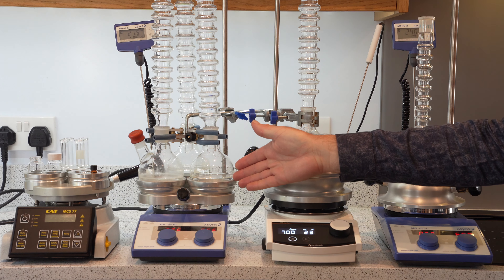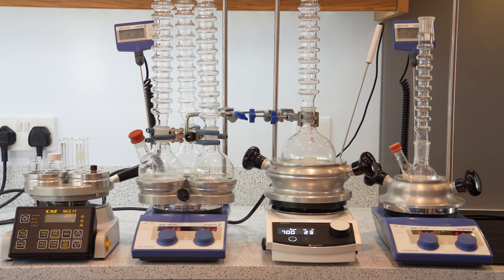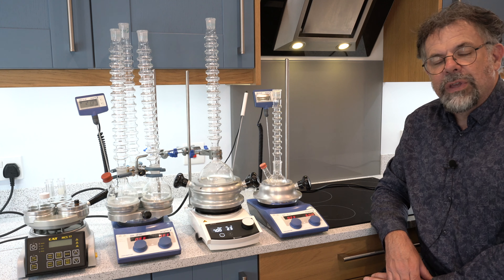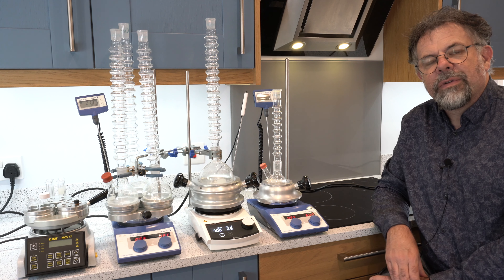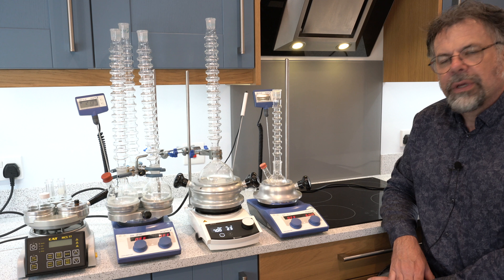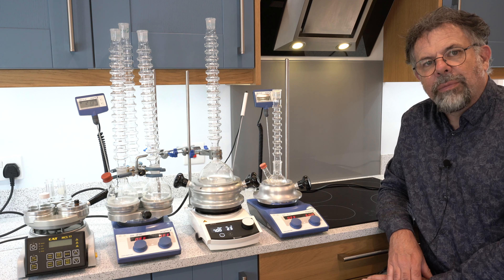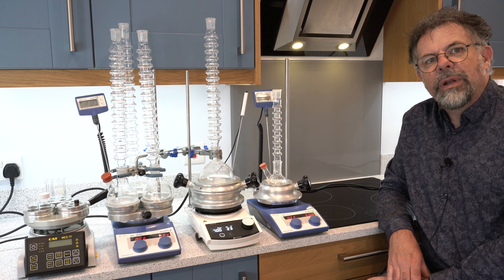Further along we have our DrySyn Multi. DrySyn Multi allows experiments in parallel — and there's another video I'll link to above, just click on that if you want to find out more — and that allows three experiments in round bottom flasks. We have various configurations and kits available so you can do parallel experiments up to 500 millilitres if you so wish.